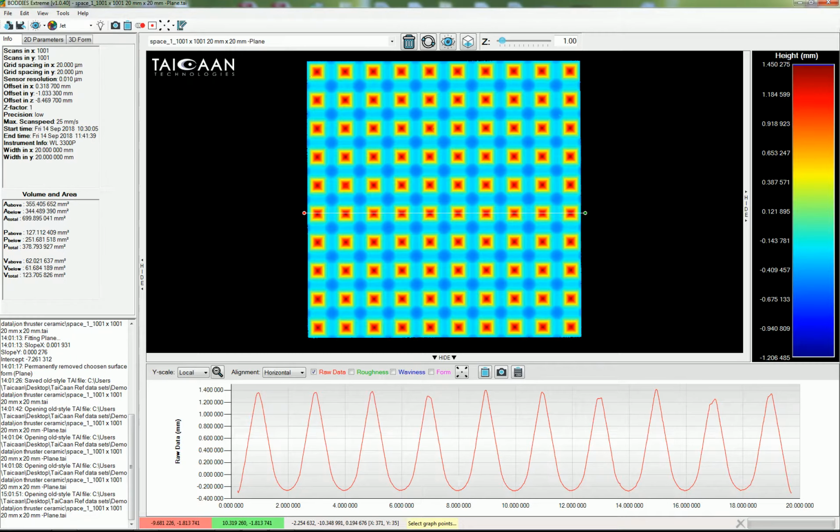As a standard metrology tool, one of the simplest things would be to determine the distance between particular features. So if I was interested in the first two pyramids here, pointing at these with the crosshair, and wanted to know the distance apart, I can find that very easily from this cross-section. Just click the point icon, and that gives me a crosshair positioning capability.